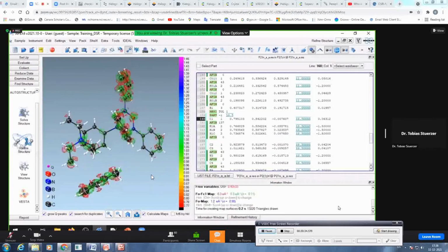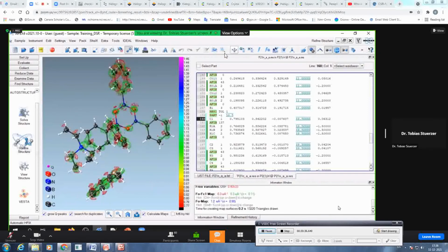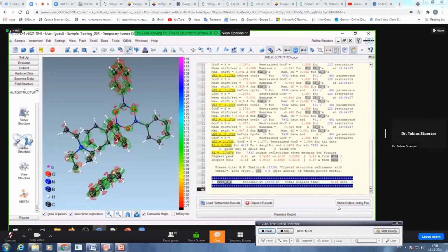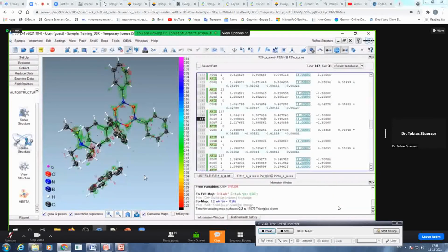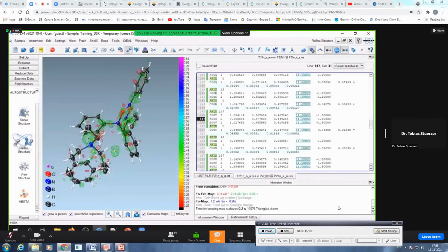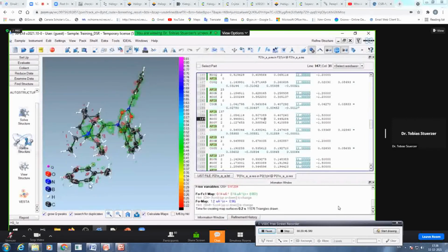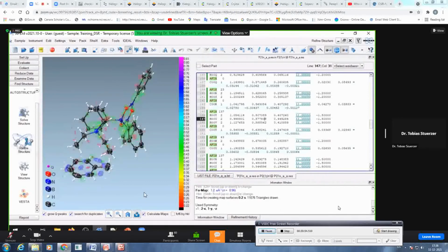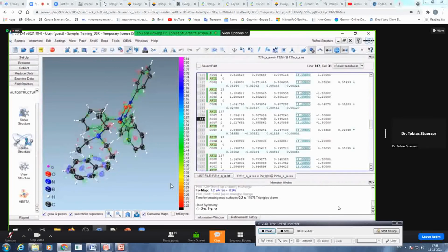And then the only remaining thing we have to do is make it anisotropic. And we are down to 5%. Okay. And now it's up to you again to check whether this looks reasonable. You see the ADPs get a bit elongated, of course, because the other one is overlapping. I personally would try to use some restraints here, like the RIGU, to make it more reasonable.